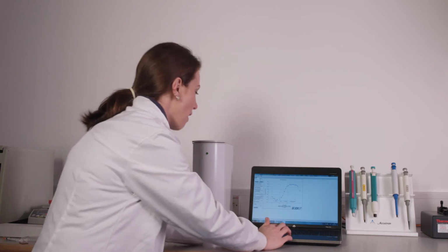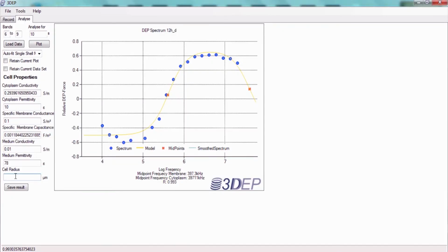So in this case, it's 5, but then if we come in here and tell it 4, you can replot that data, and it replots a new model. So it hasn't changed much, so you can verify that that change in radius measurement hasn't done anything to your model. If it does do things to your model, then you may want to consider saving all of those results.